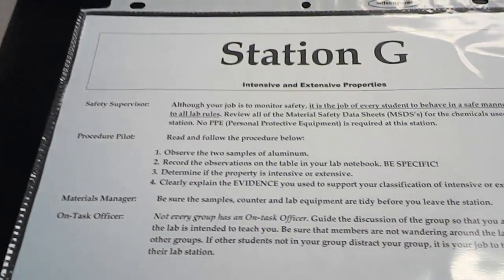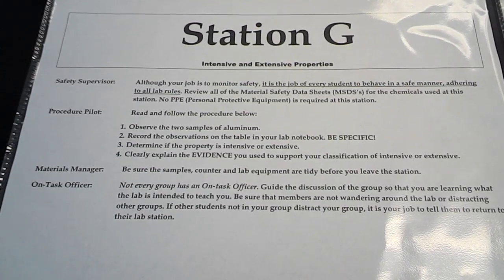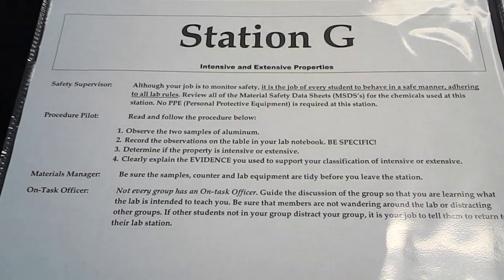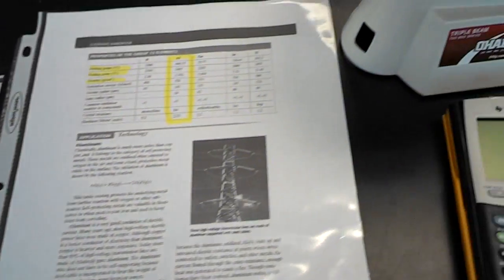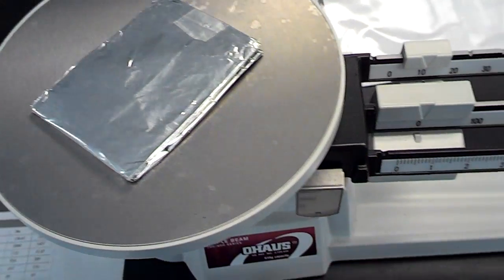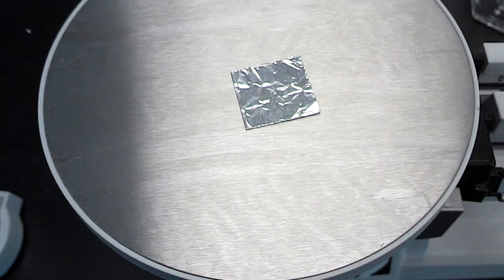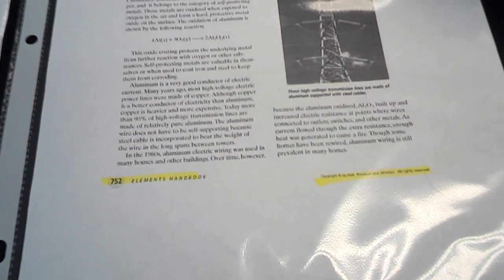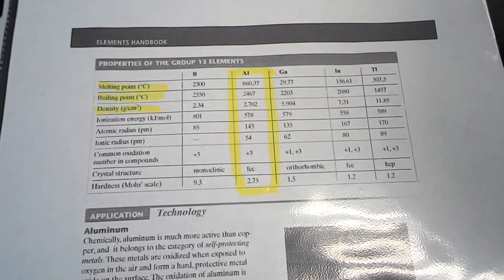Okay, now we're going to go to Station G. Station G is observing intensive and extensive properties. So you're going to observe 2 samples of aluminum, and one is larger, one is smaller. So you have a larger sample of aluminum, and then you have a smaller sample of aluminum. You're going to fill out your table with the variety of properties. On page 752 of your textbook, it has several properties of aluminum highlighted here in yellow.